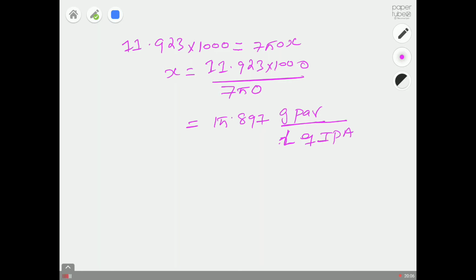Many of the people who work in the crystallization field use up to three numbers after the decimal point. So try to stop here. Don't write some number like 15.9871234 until you finish the ink in your pen. Don't do that.